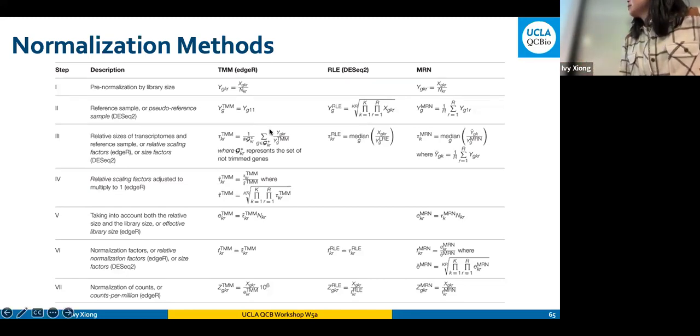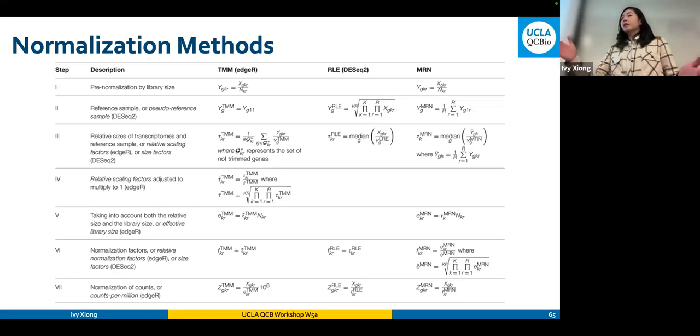And one thing that I like quite a lot is TMM, which is trimmed mean of M values normalization. What they do slightly differently is they only care about genes that are not trimmed based on the raw read. That means we only care about genes with meaningful readout, because a single experiment can generate this count table for up to 60,000 different gene regions. 20,000 of them are known, annotated genes, but there are also pseudogene regions. For any experiment, usually you get around 10,000 genes that have meaningful expression.